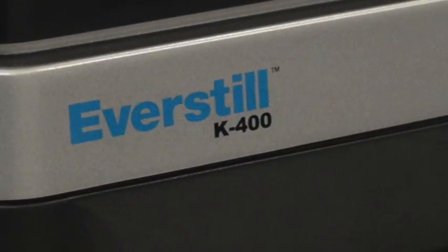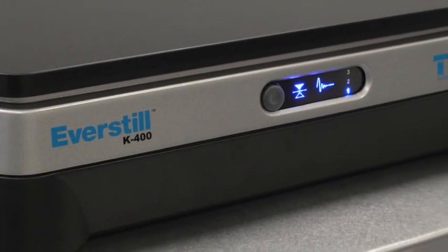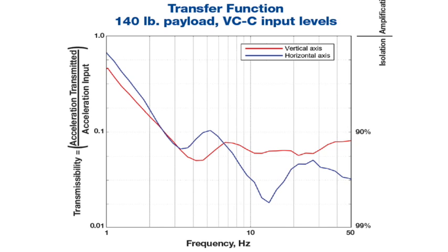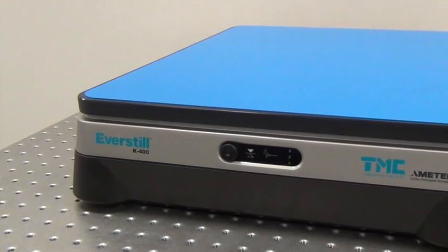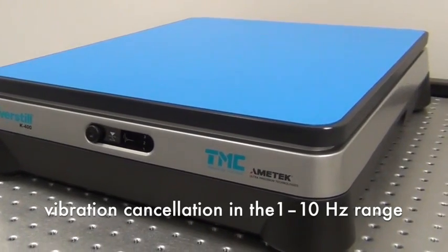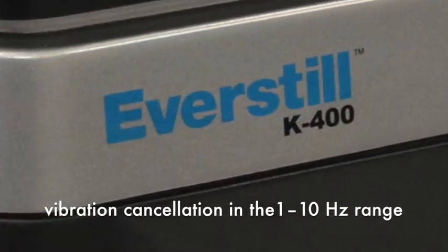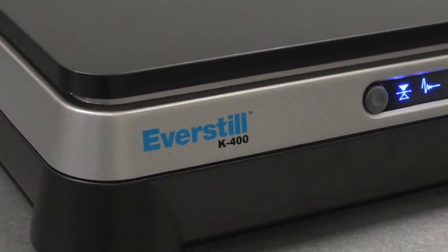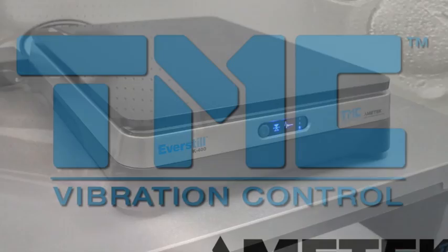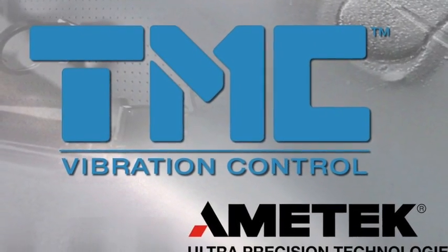The patented EverStill technology delivers aggressive vibration cancellation starting at 0.6 Hz in a compact serial-type design. The K400 is the first benchtop system with the EverStill technology. The best-in-class vibration cancellation in the 1 to 10 Hz range is a significant advantage for researchers, technicians, and designers who are pushing the limits of their small precision instruments.